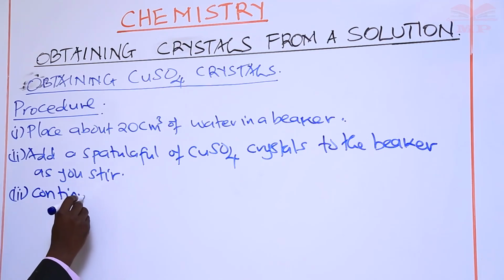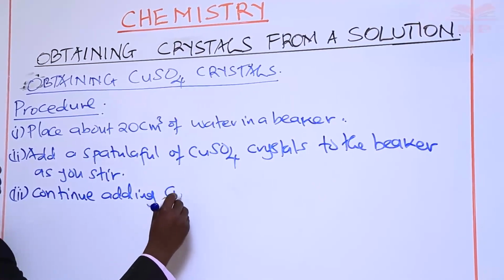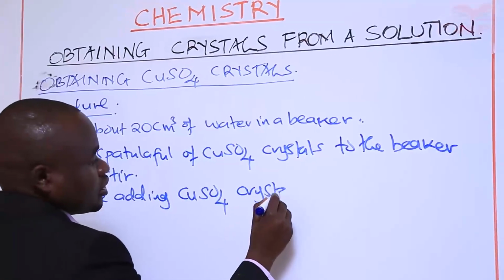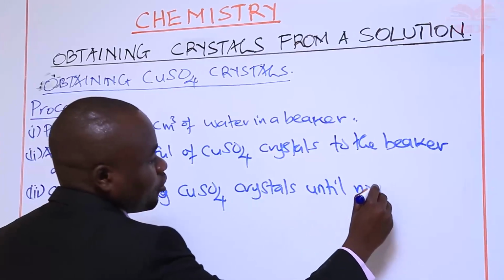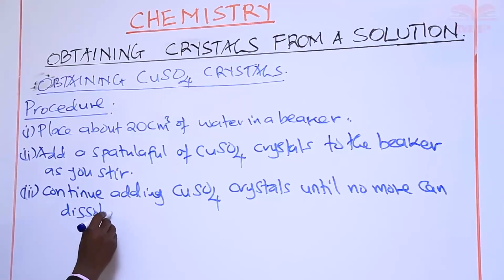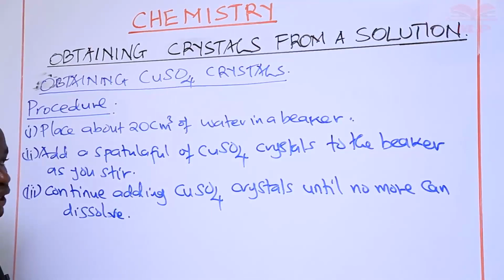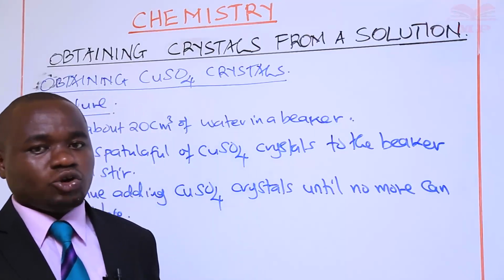Thirdly, continue adding copper sulfate crystals until no more can dissolve. You'll realize at one point, when you add more and more copper sulfate, none of it will dissolve.